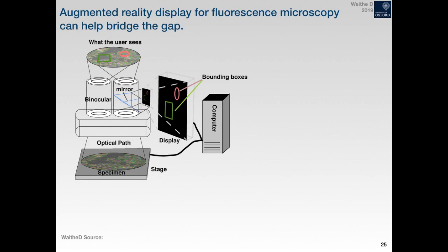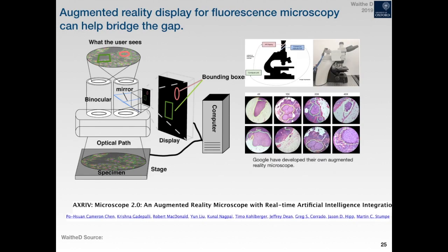I'm not the first to publish this, unfortunately. Google beat me to it, but when I wrote the grant, they hadn't done this. That's just my disclaimer. But I'm the first to do it for fluorescence microscopy, and my system's very easy to implement.